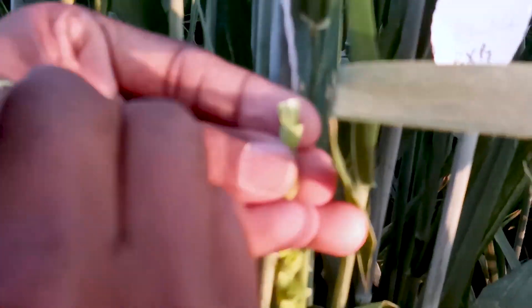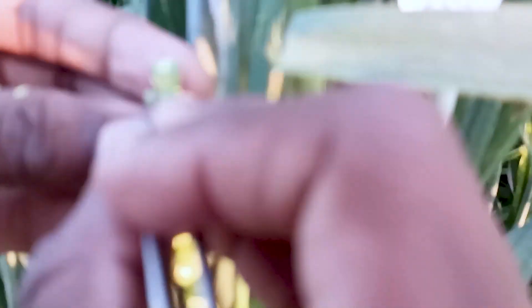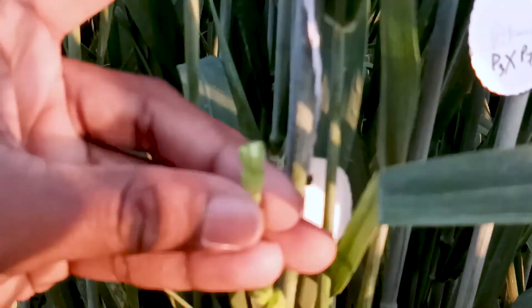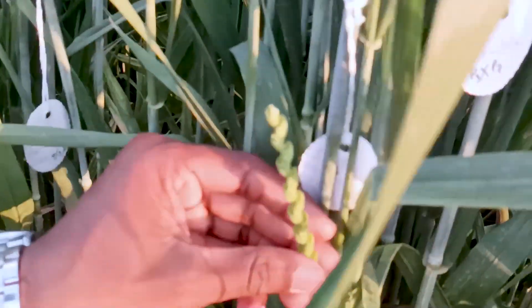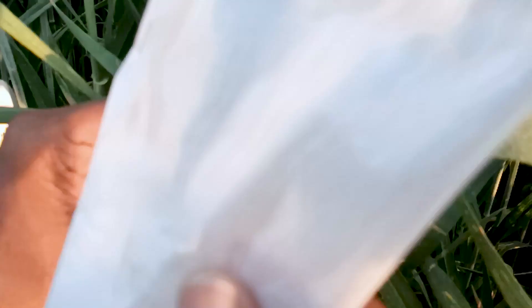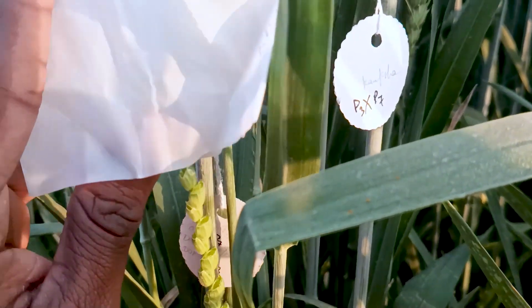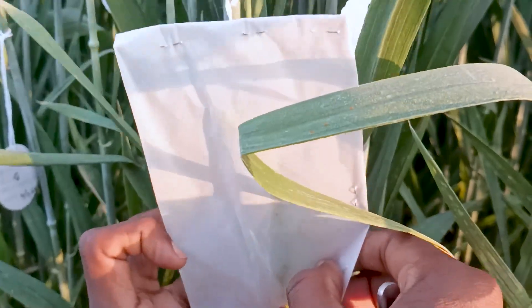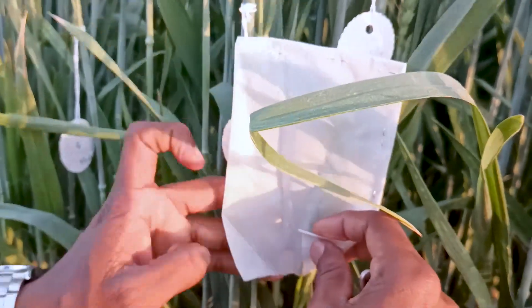We have emasculated the whole spike. After removing the last anther, we will cover it with a butter paper bag. We have to put the butter paper like this and fold it, then clip it with a U-pin parallel to the spike, because if we put it any other way the translocation of food material will be hampered.